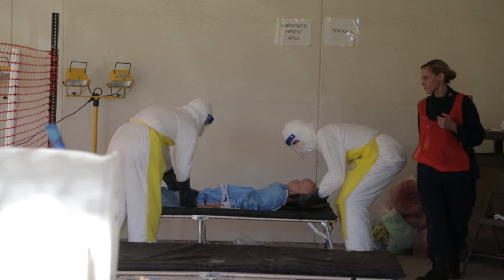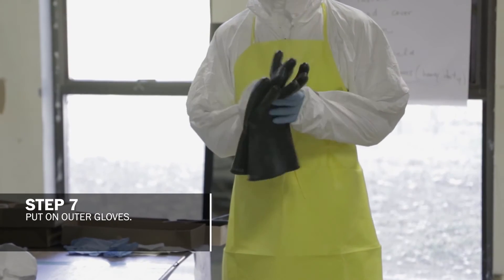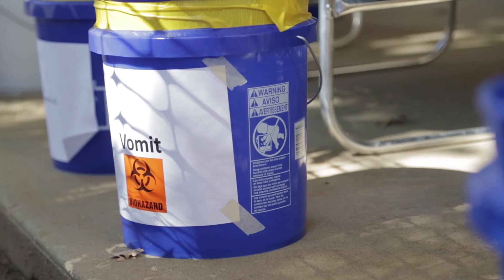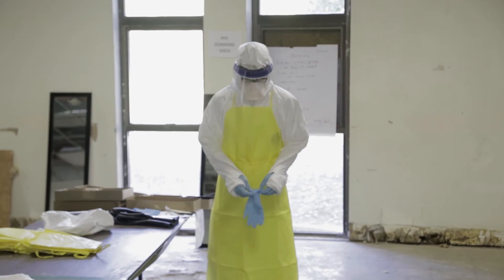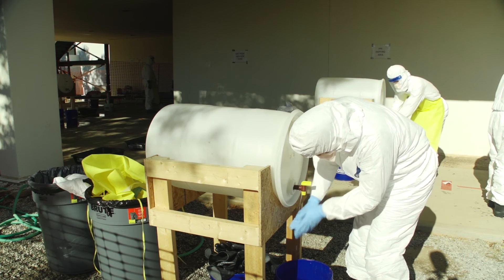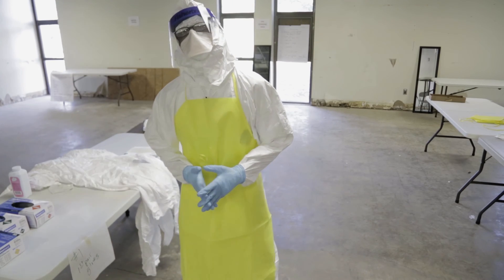Depending on the nature of the work that will be done, there are either these heavier-duty gloves used during transport of patients or cleaning up of heavily contaminated surfaces, or a second pair of gloves that will fit over the thumb hole that we cut out, over the sleeve. And that is the final step in the donning process for putting on personal protective equipment.